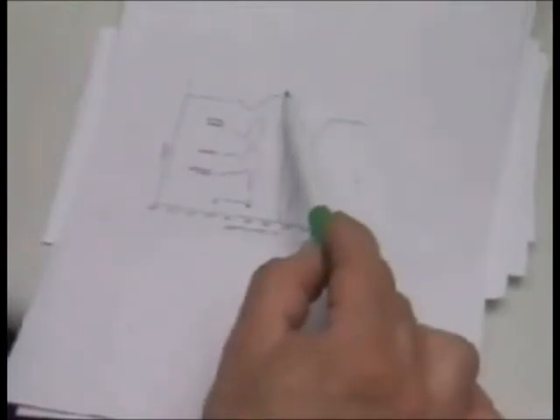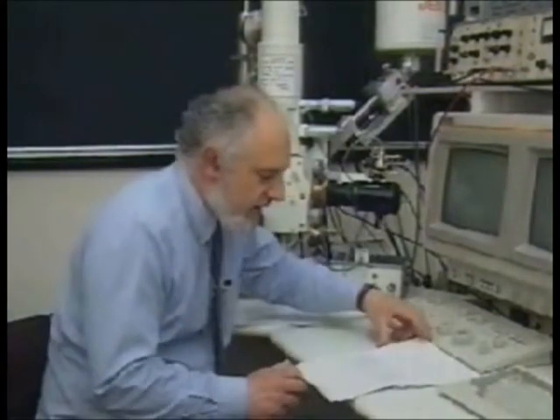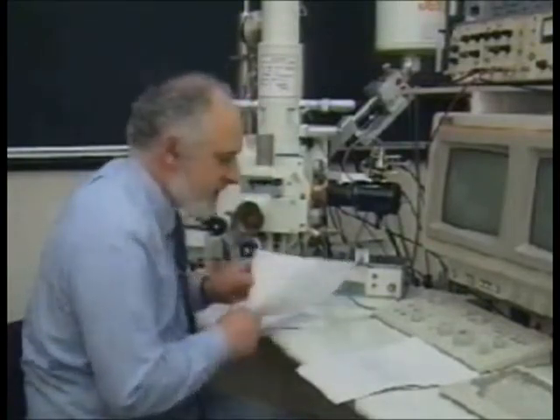The other technique is Auger spectroscopy, and the diamond fingerprint from such a spectrum is as shown here, with these peaks rising in a succession of 3 peaks and then falling to a minimum at about 268 electron volts. Well, what we observed on the very surface of the sample, this is the tungsten carbide, the film on the tungsten carbide, we observed a peak which is not characteristic of diamond, in fact is characteristic of just amorphous carbon. But when we removed that amorphous carbon by ion milling, then we obtained a peak which is much more characteristic of what we would expect from a diamond film.